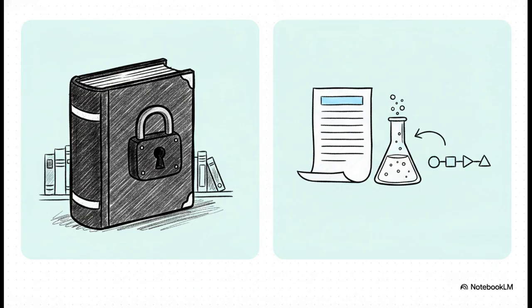Think of DNA like a massive, heavy reference cookbook locked safely away in a library. It has every recipe for your entire body. RNA, on the other hand, is just a single, specific recipe page that a cell has photocopied so it can actively bake a protein right now in the kitchen. When we perform RNA-seq, we are essentially sweeping up millions of these tiny genetic photocopies from the kitchen floor to see exactly what recipes the cell is cooking up at that exact moment.